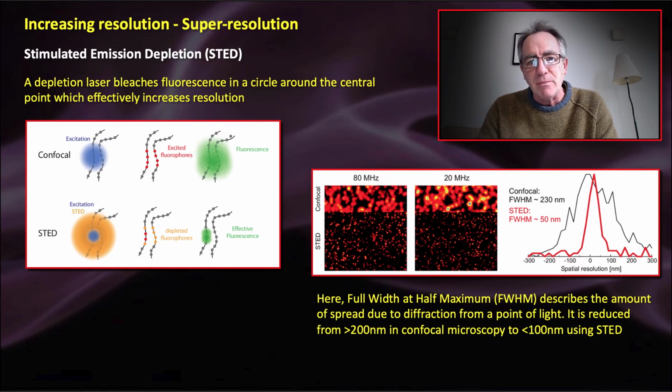The most famous and the most useful, as far as I'm concerned, of the super resolution techniques is this one that's called stimulated emission depletion. Look at the picture here. From a confocal microscope, you use the laser to excite a region.